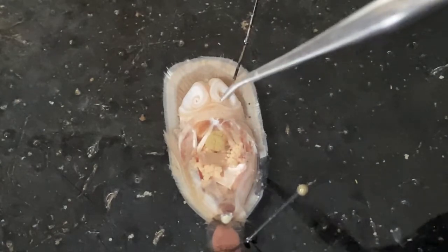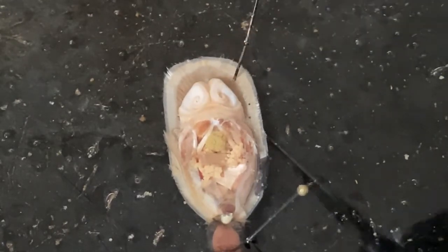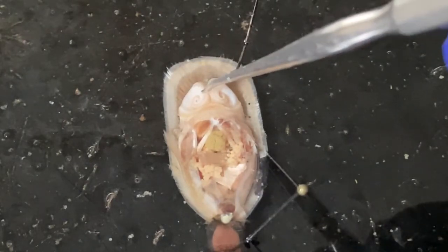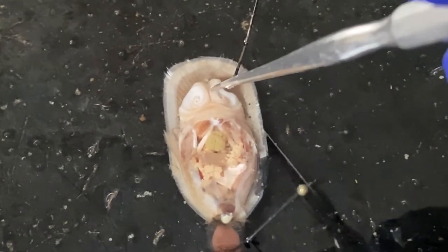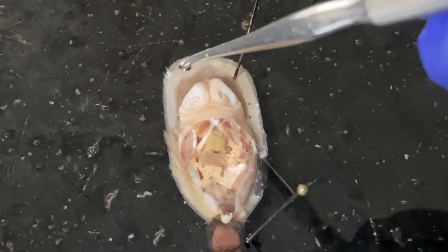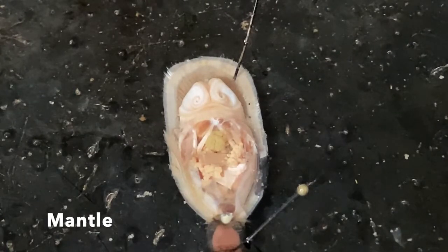The two arms of the lophophore, one curling to the left over here and the other one curling to the right over here, have short tentacles attached to them that are all the way around the edges. If you had an opportunity to see this firsthand, you would see that these lophophore supporting structures are rather stiff. This tissue that goes all the way out to the edge of the shell, we call the mantle, just like you call it the mantle in bivalve mollusks.